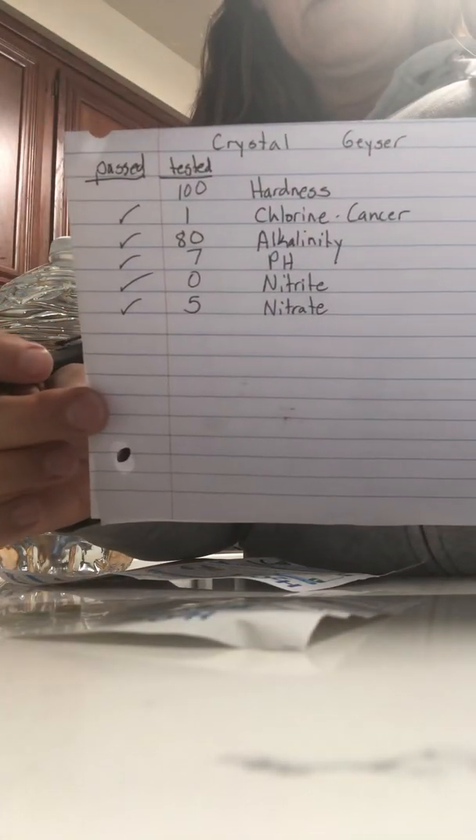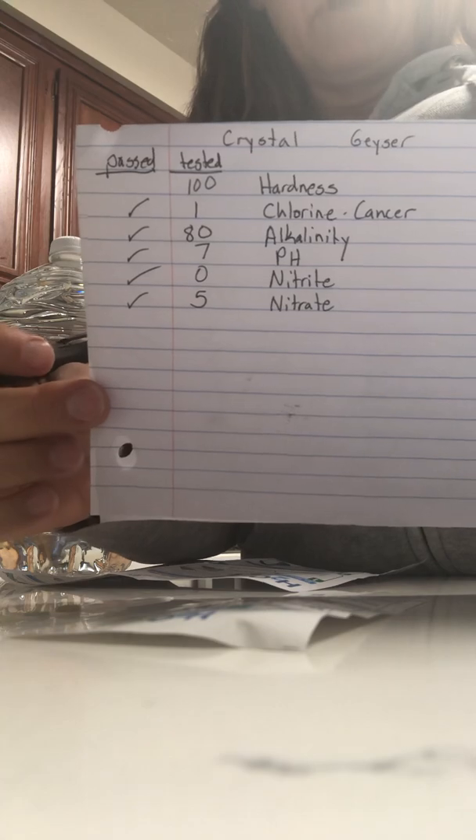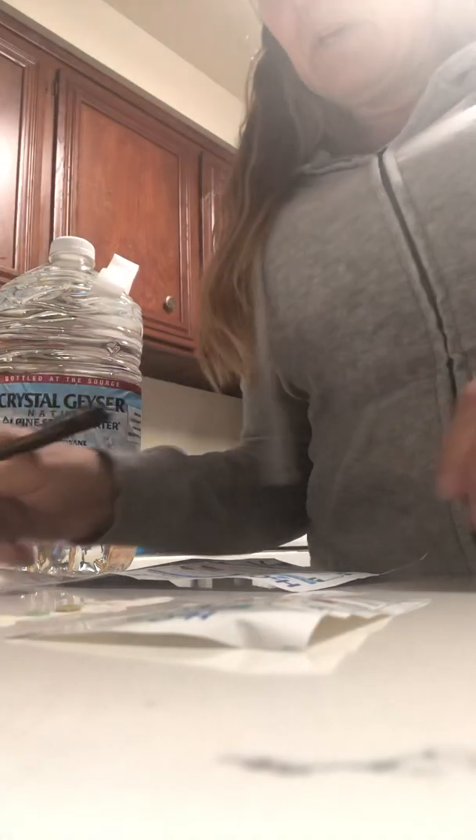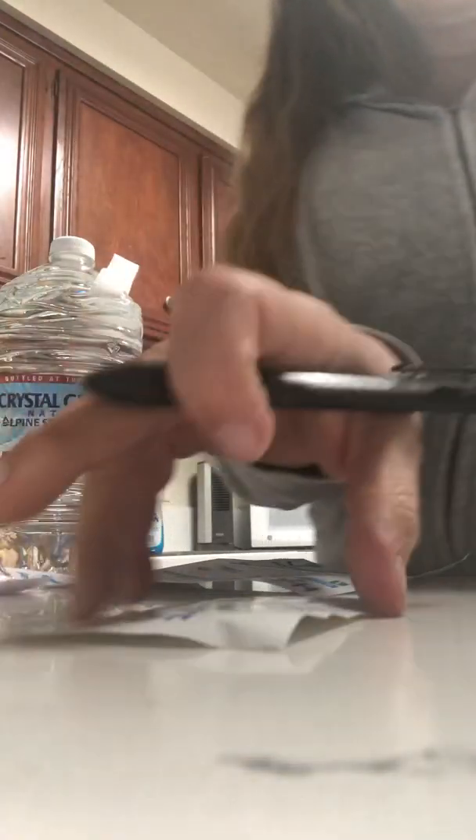So this is the test so far for Crystal Geyser — this is amazing! I'm not sure what the hardness does to your body, but I'm going to look it up on Google and figure out if hardness really matters. So the next test we're going to do — let's do the copper test.